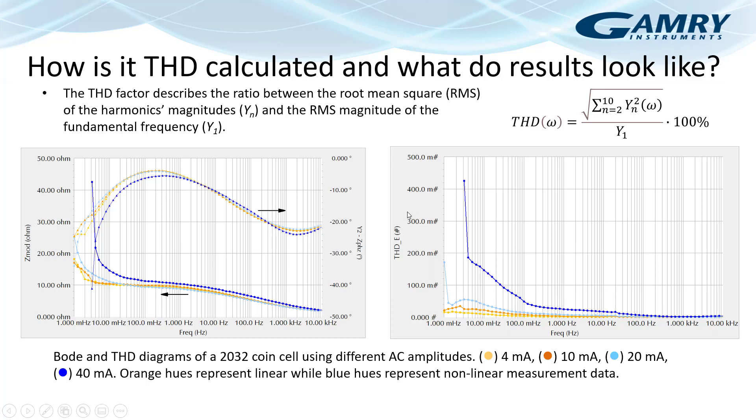And if we want to examine the magnitude of that non-linearity, we would go ahead and choose to plot the total harmonic distortion for the potential. We calculate total harmonic distortion for the potential and for current. And of course, we also let you view the individual harmonic distortions for each of those harmonics. We don't show that here just to save time. So you can see at the lower currents, the 4 milliamps and 10 milliamps, we have very low amounts of total harmonic distortion. So we likely maintain linearity. And then for the blue hues, we can see higher amounts of total harmonic distortion. And there's no general guidance for what is an acceptable amount of total harmonic distortion that is for you to interpret and decide for your particular system. But we wanted to show that you can measure that here.